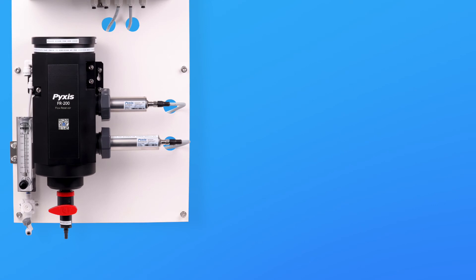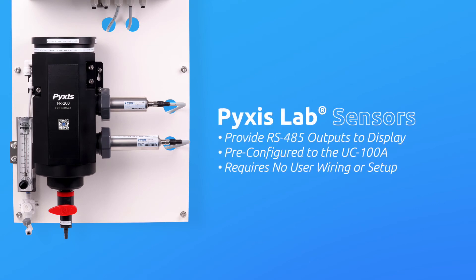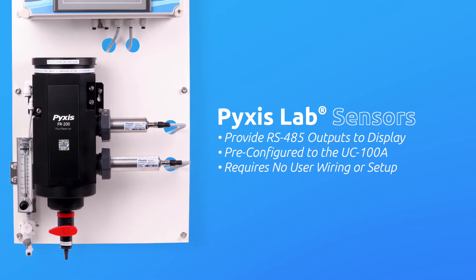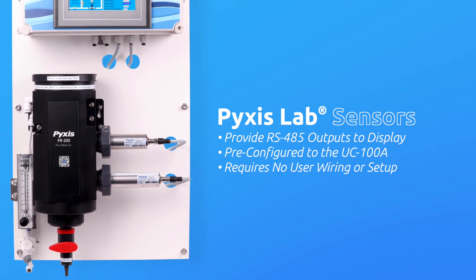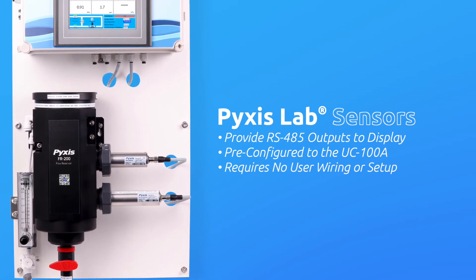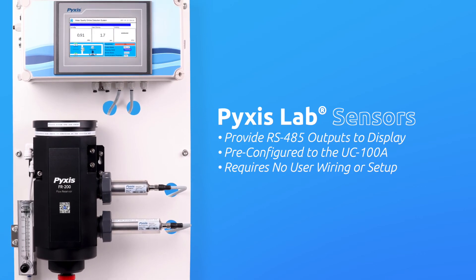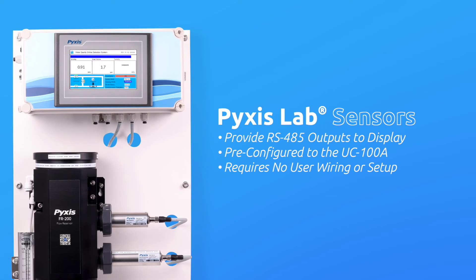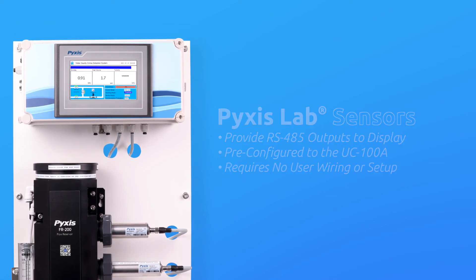Both sensors are 24VDC powered and provide fully integrated RS-485 output signal to the pre-mounted display. The sensors are pre-wired and pre-configured to the UC100A display and require no user wiring or setup. The RS-485 communication feature enables optimum data transfer and diagnostics of each inline sensor by the UC100A display, making startup, operation, calibration, and maintenance easy and reliable.